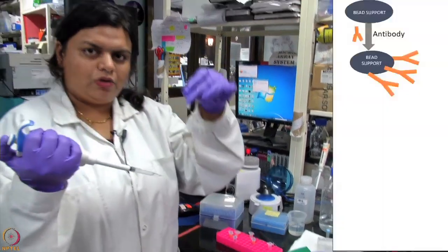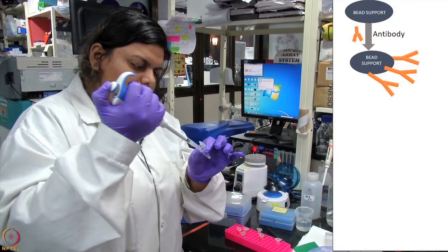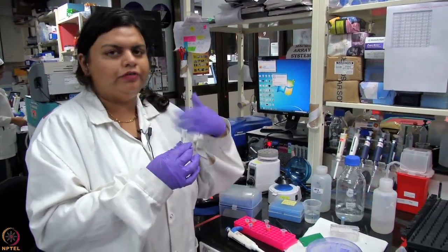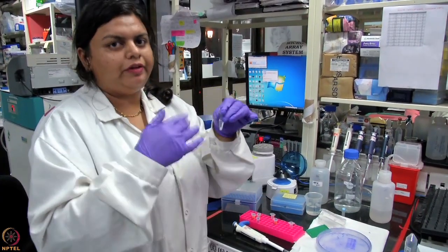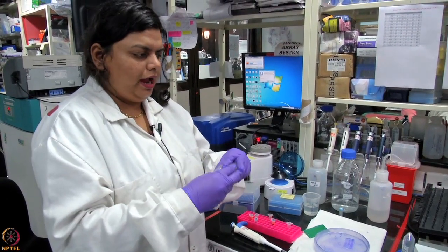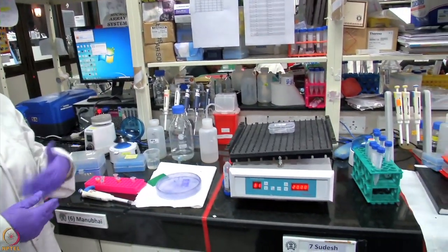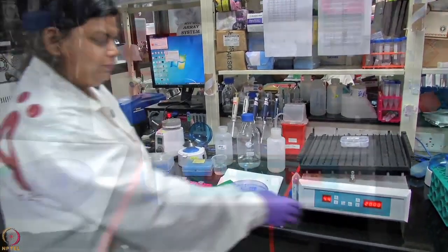The bead is already activated using the wash solution, to which we'll add the antibody. After adding the antibody, it is not advised that you do a very vigorous shaking or mixing. You just gently tap it so that everything is properly mixed, and then you again place it in a container and put it on a rocker. Either you can leave it for 2 to 4 hours or you can do this step overnight.